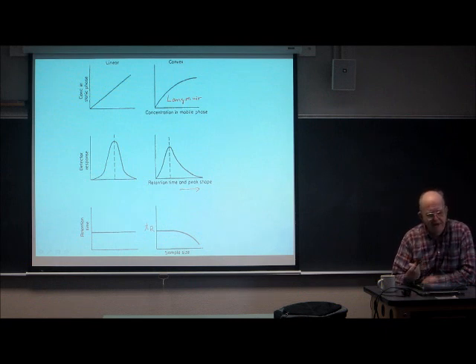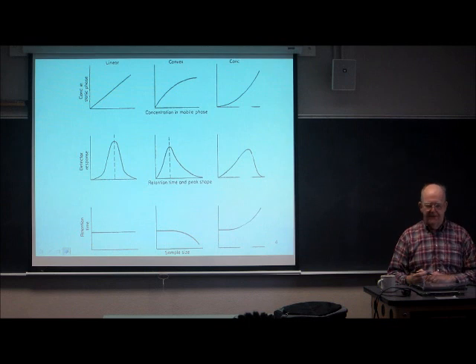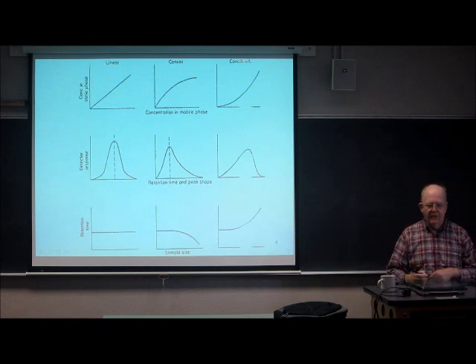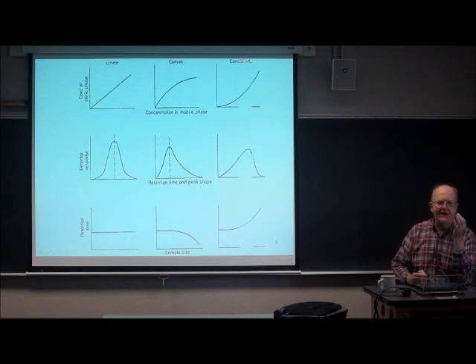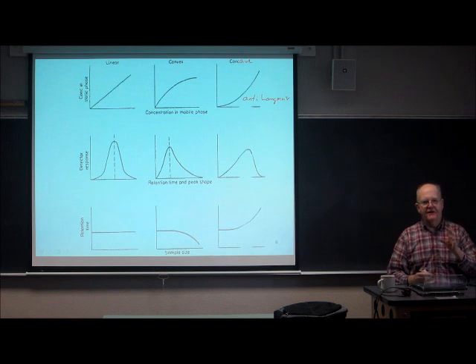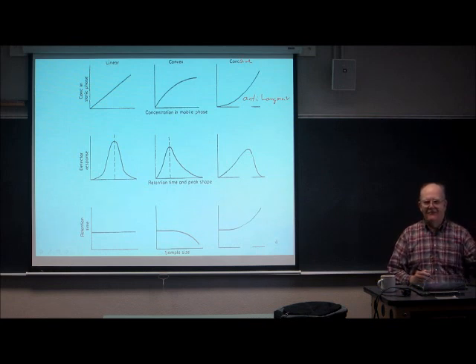There's a second kind of isotherm. It's where the curvature goes the other way, and this is what's called concave or positive curvature, and it's also called anti-Langmuir. And that sort of tells you anti-Langmuir behaves exactly anti what a Langmuir does.